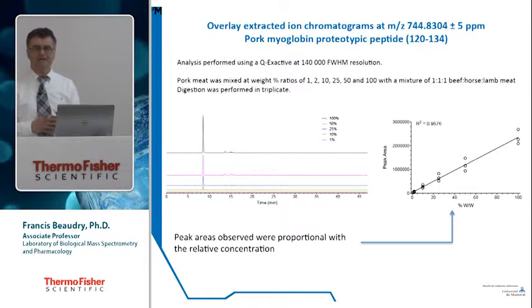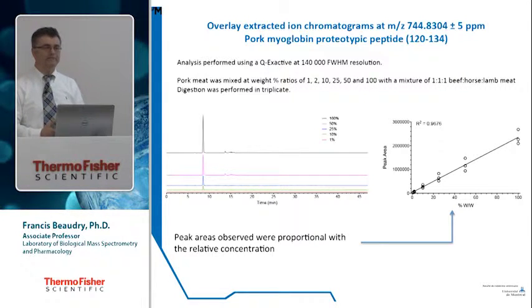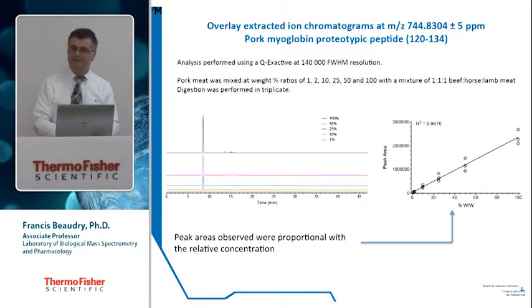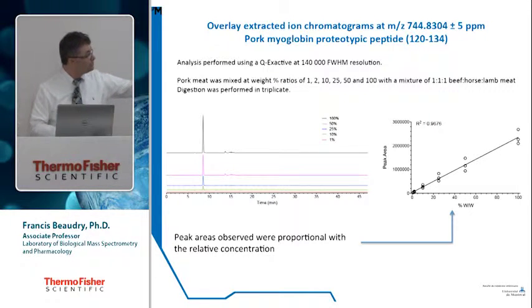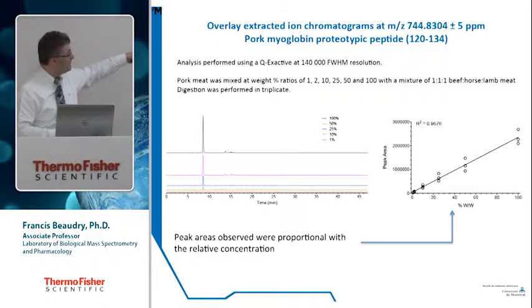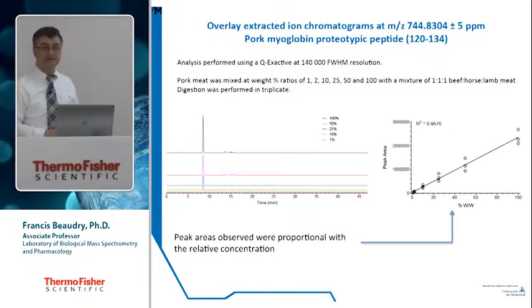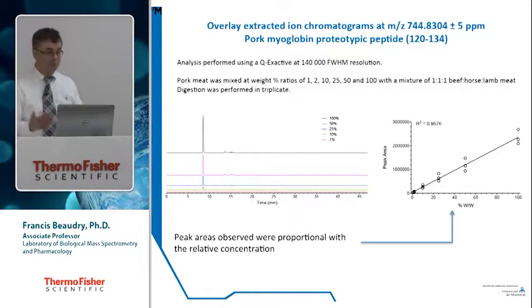Yes, it is. Somehow it is. For sure, people that have a background with small molecules don't expect the same type of quantitation, but for this type of quantitation, it's very revealing because we are able to have kind of a linear relationship between the percentage of pork meat in beef compared to the intensity of the peak we observe. So it's very linear, very reproducible. When we overlay the spectra, they look very nice. The signal, well, at 1% it appears low, but it's the same scale, so you can still see it, and we can go down. In this case, we went to 1% because of the regulation, but we could go lower than that.